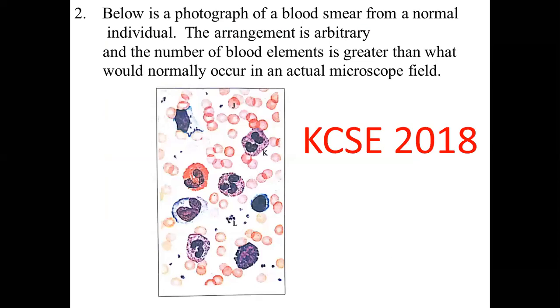But an examiner now can bring a prepared slide. We may not be told to prepare a blood smear, but look at the KCSE 2018 question, photograph, paper 3. So below is a photograph of a blood smear from a normal individual. Number one, wale wanafunzi wako wanajua blood smear ni nini. Just to begin with, it put them off. They didn't know where to turn to. And you see, this is a question of about 15 marks, because every question in paper 3 has around 15 marks out of 40. So most students may have been caught off guard by this one.